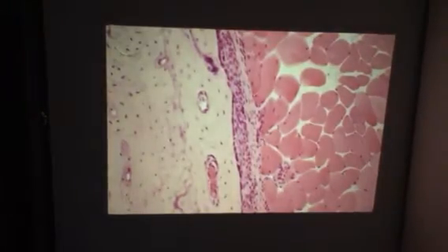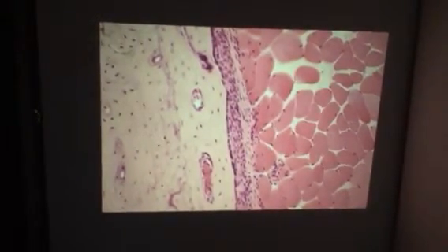And what is this tissue? Compact bone, lamellar bone, and all of these little fine lines that we see in there, what are those? Canaliculi. And around the outside, we have a cementing line. Actually, we'll see better cementing lines when we get to the alveolar bone next semester. For some reason, they show up very nicely in that particular bone. And right in the center would be the Haversian canal, and this would be an osteon. And that's all of those lines. Any questions?